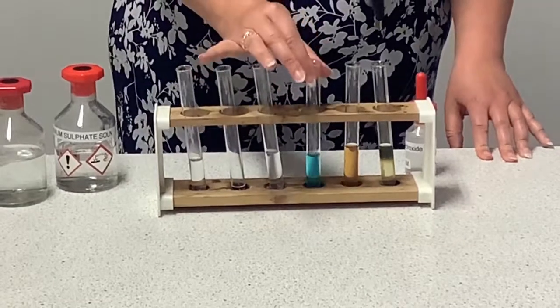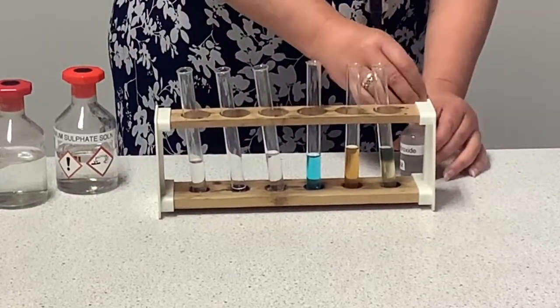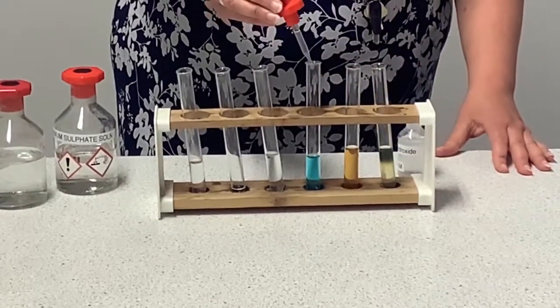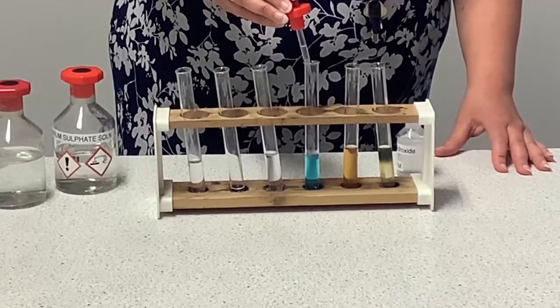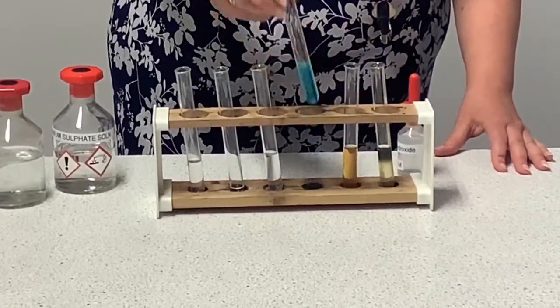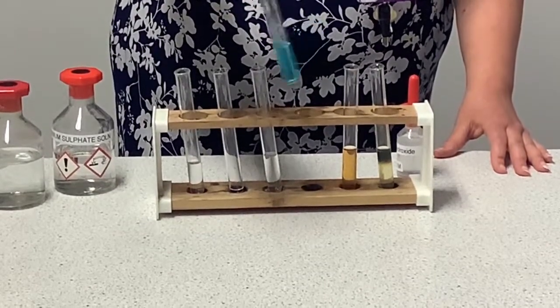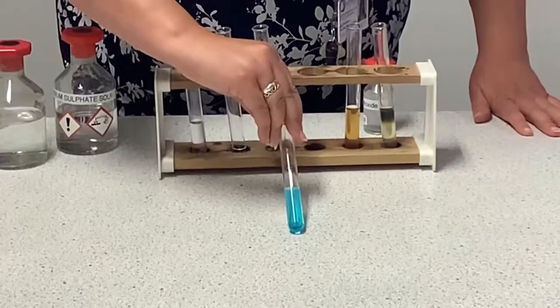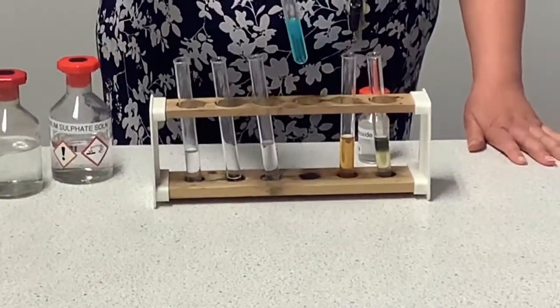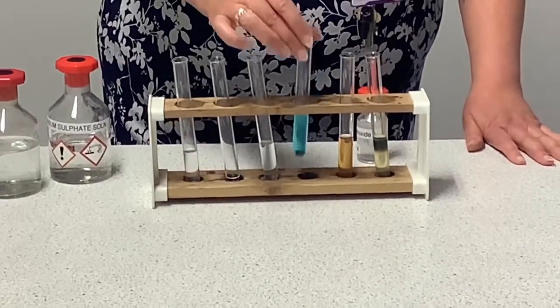The next one we're going to look at is copper. Now you'll remember we could test using a flame test for copper. This is another test we can do for copper ions. And again, it's the same reagent, it's the sodium hydroxide. And again, when we leave it and watch, what will happen is we are getting a blue precipitate forming. So again, a blue solid forming within that liquid, and that's a positive test for copper ions, and it's just collecting there at the top.